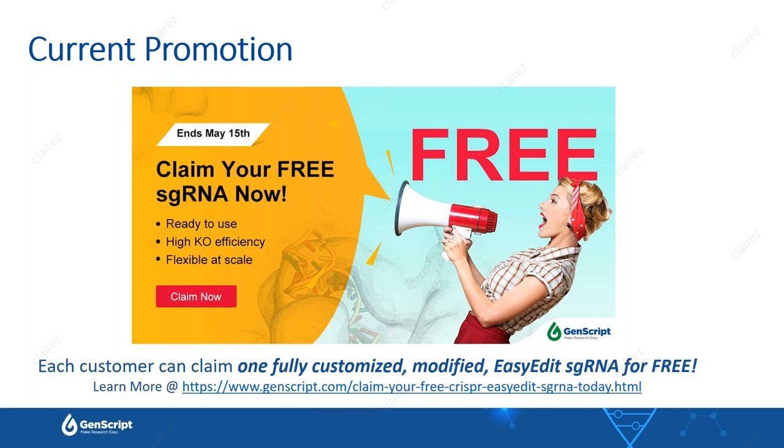Another question, how do we deliver Cas9 protein into cells? Is there a selection step after Cas9 expression? If this is about the RNP system, then you should not need to do any sort of selection. That is another big advantage. You should have very high knockout or whatever editing efficiency without needing to do a selection. And again, that's what makes the system so good for either animal models or cell therapy applications. Another one, can the RNP-based system be used with Cpf1?